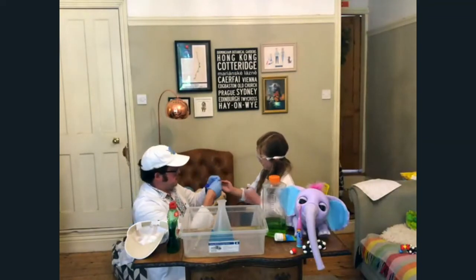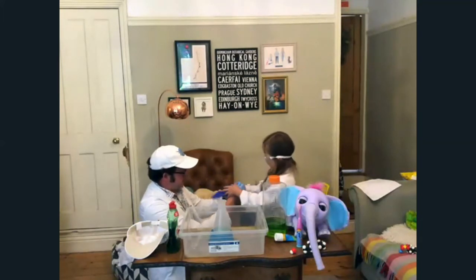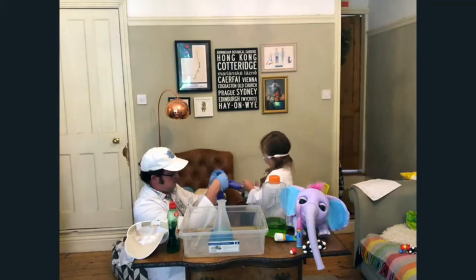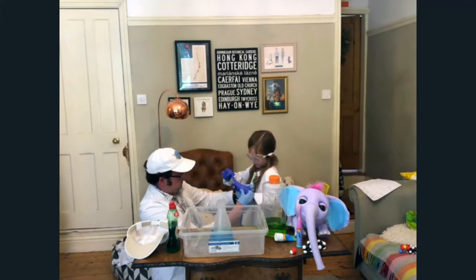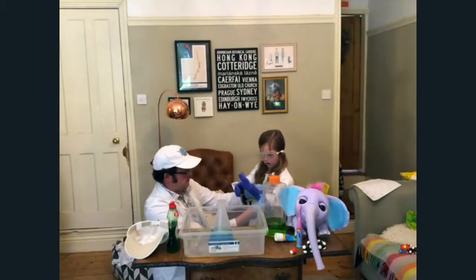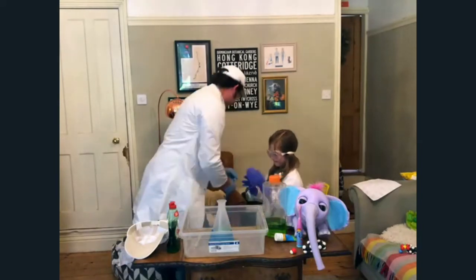There we go. Right, wiggle that in. I think these gloves are a tiny bit too big for you as well. Get that thumb in there. Always remember your PPE, especially at the moment. And put that through it, put that in. Good girl. Wiggle those things through. Yes, that'll be good enough for now, won't it?